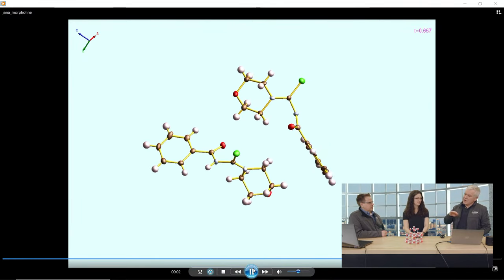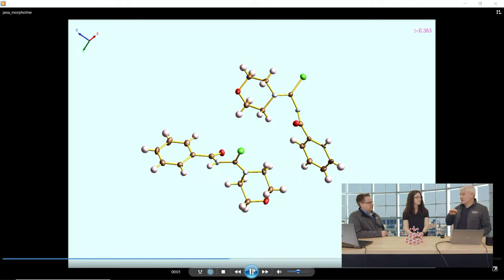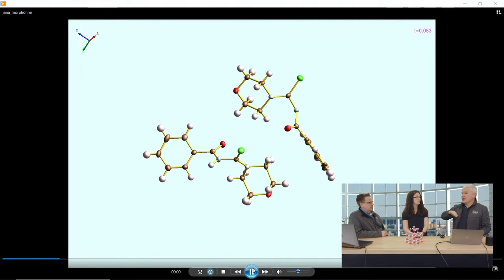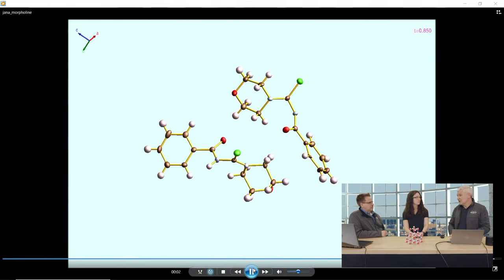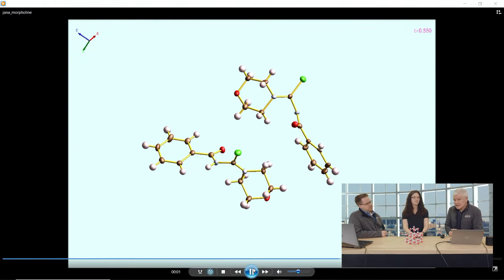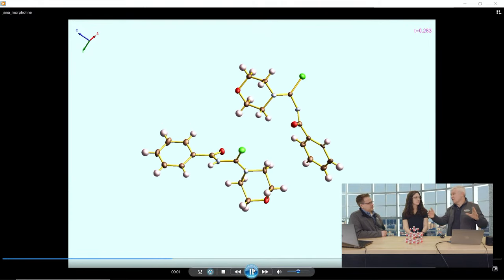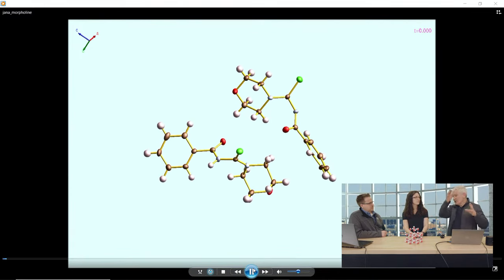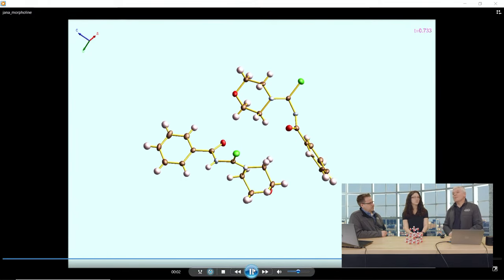So the atoms, in higher dimension, are not points. You really have to understand them as one-dimensional atomic domains, and they actually are in the fourth dimension on the curve, which is called the atomic modulation function. So what people have done, and that's really cool, is this modulation function, the period is on an axis that's called t. Now you take this axis and put it into the time domain, and you pretend you're just moving along this axis and do this for all atoms. And then you can make these movies.